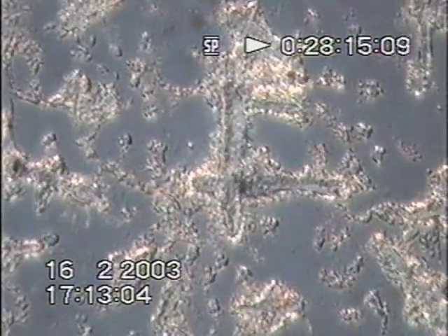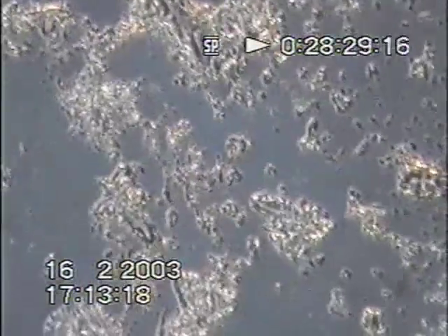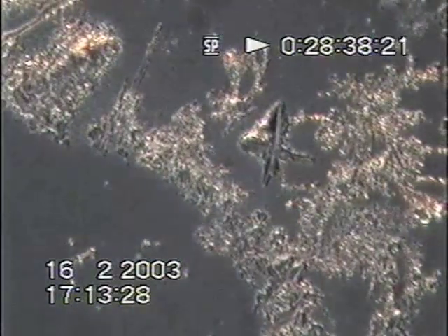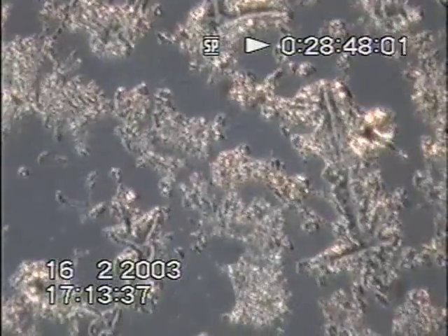Perhaps better shown here. This is mainly this white stuff, whatever it is. And that's a really nice one. We're now coming to the edge of the evaporated crystals.